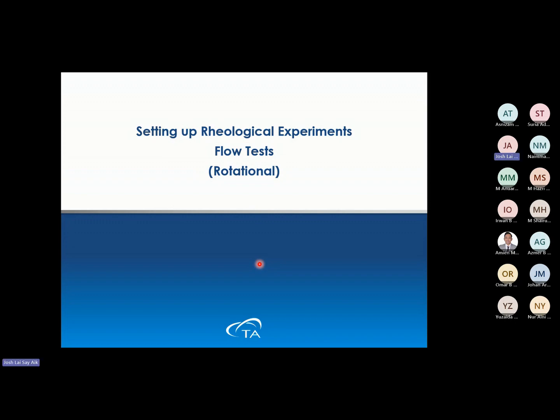I believe this kind of sample is typically unfilled and also Newtonian, so you just want to achieve a single viscosity point, right? So you can just use the lower shear rate and get the viscosity for your customer. Any other questions?